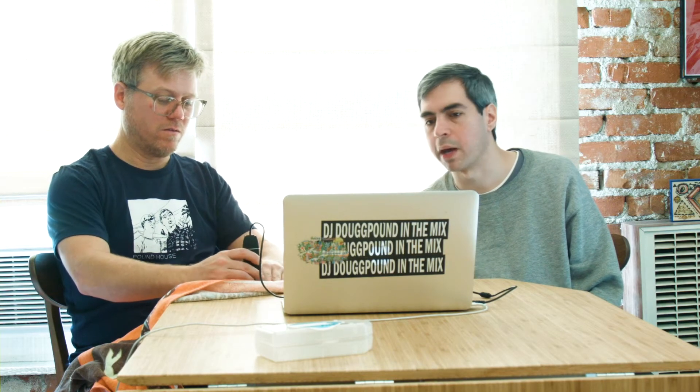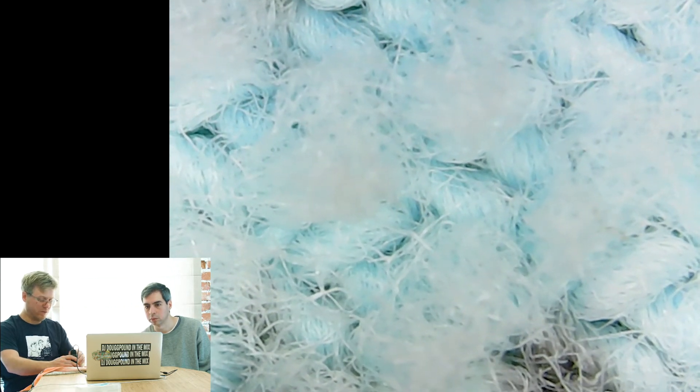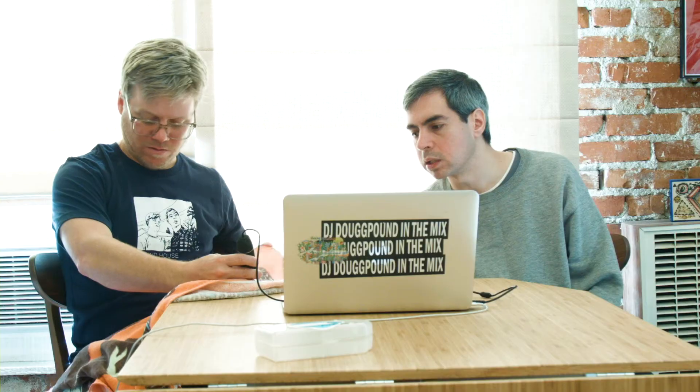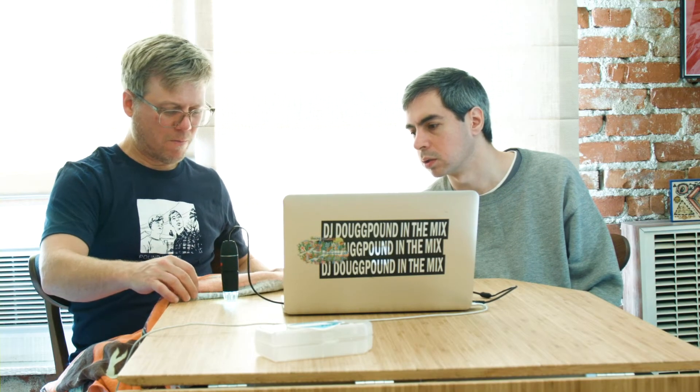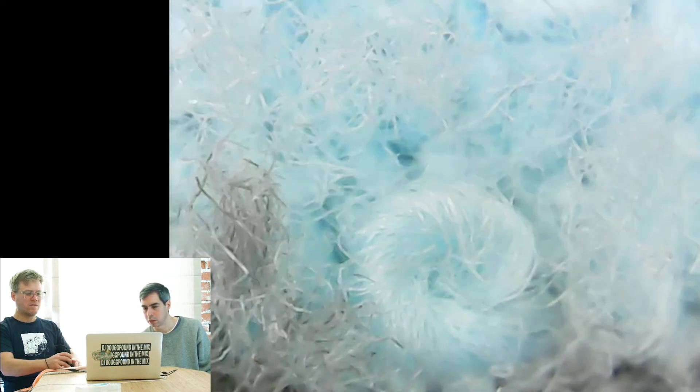Yeah, get that dark spot. There's orange. Can you get the non-patterny thing too? Well, once you're close, you can't really see any pattern. You do see stuff sticking out of it, actually. They're small. There are little things sticking out. You could see it best on that blue, if you could find that blue again — a little blue section. Kind of. Huh.